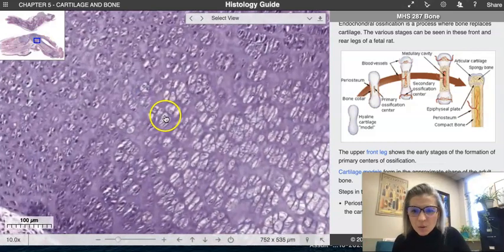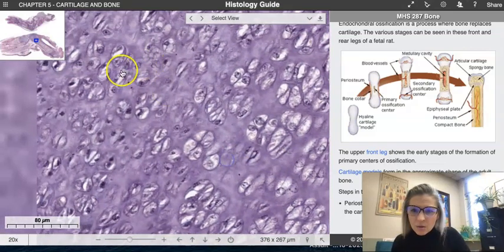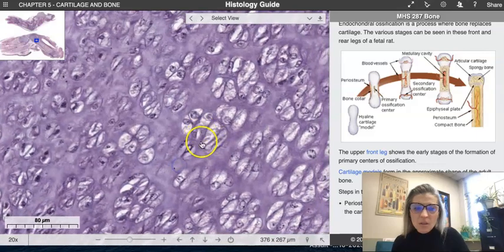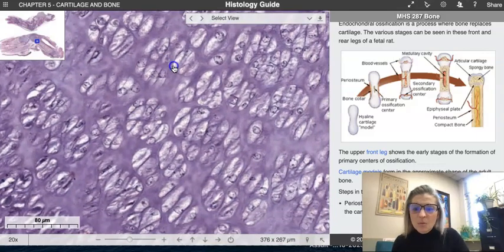As these cells are starting to have their lacunae enlarged, they also start to organize into these parallel columns. So let's go to the top area here. You can see that they're kind of scattered, but then all of a sudden they start to cluster, right? They're starting to form these clusters or these islands. And then even more so, you can start to see lines, right? Kind of strips of these cells. That's what we refer to as those parallel columns of chondrocytes.